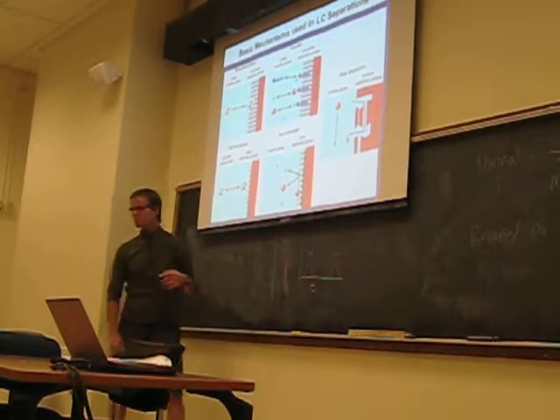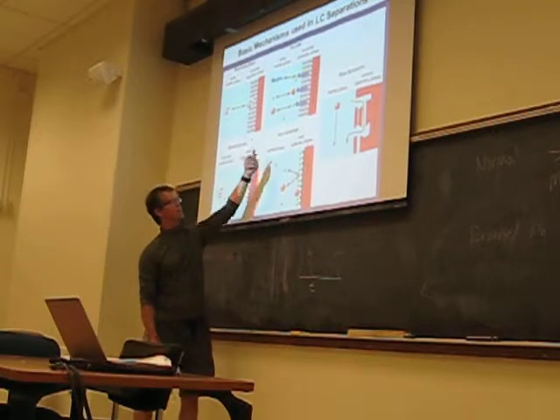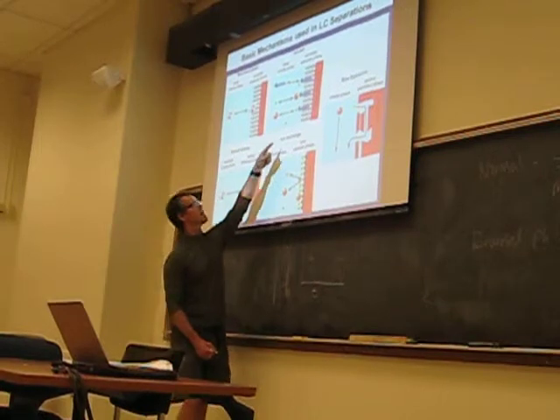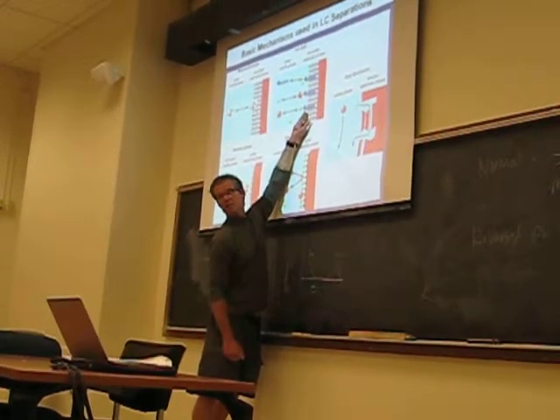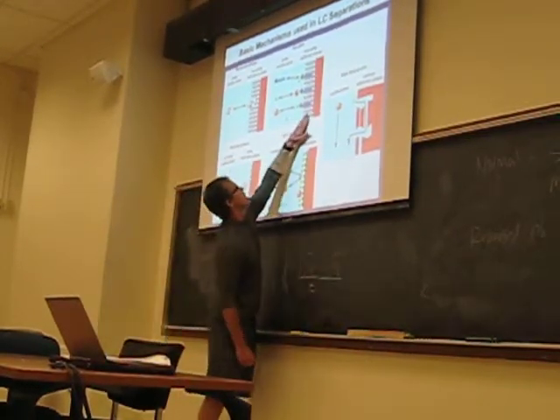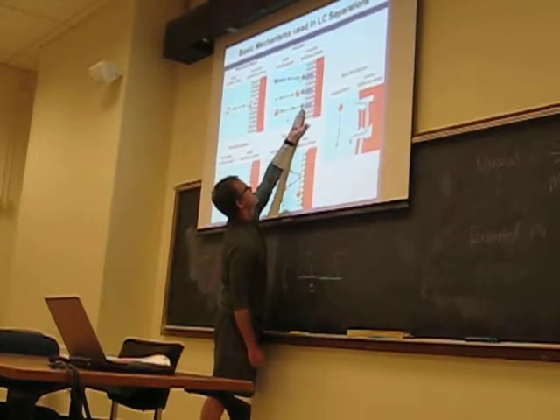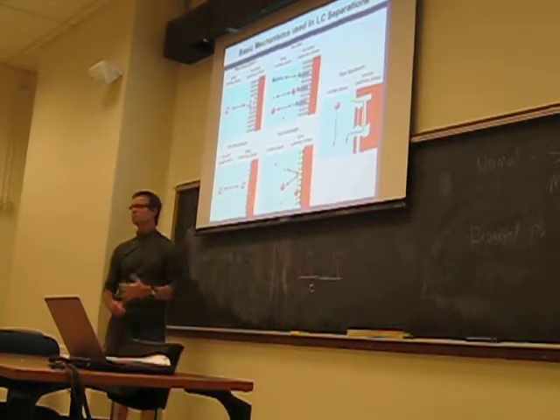And the advantage of this kind of thing, you might say, why do that? Why not just do this, right? The advantage is that you can actually titrate, by having different concentrations of the ion pairing agent in the mobile phase, and by which ion pairing agent you use, the degree to which these ion pairing agents associate with the stationary phase, providing the separation.